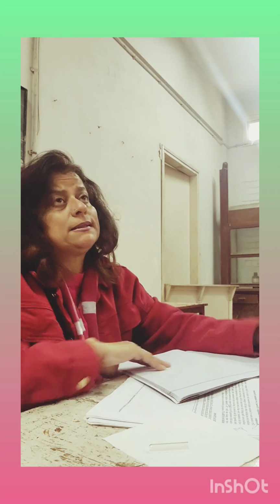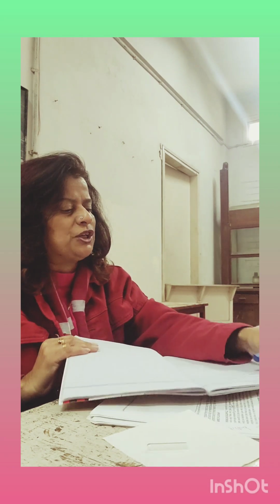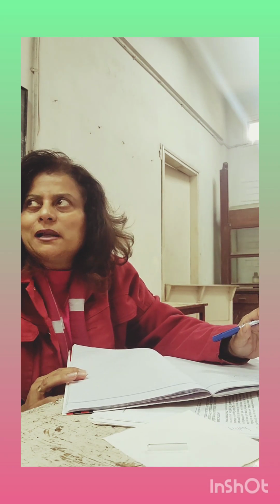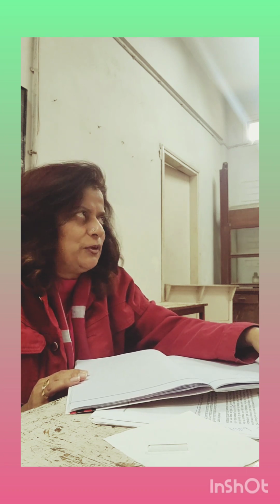Okay, so this is experiment number 1. Very good. Step number 2: you will write down detection of elements. Please adopt this format. Whatever I'm writing here, please adopt this. I'm requesting you, do not adopt your own ways to form the journal, because they have already given us a way to continue with our experimental process. So just follow this experimental process. I would appreciate that.